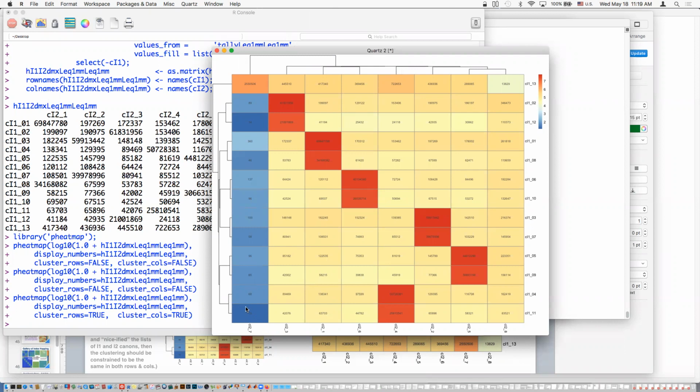But mostly you see poly-G I1, user I2; it's much more rare to see user I1, bias canonical I2. We've also got this poly-G I2. But those are second order concerns relative to the index hopping that's filled up with this grid.